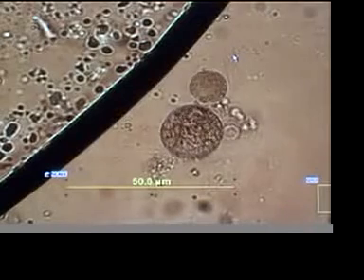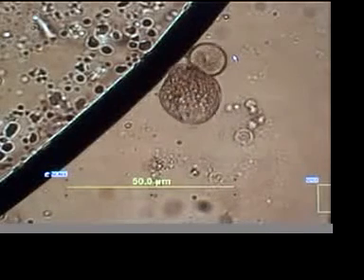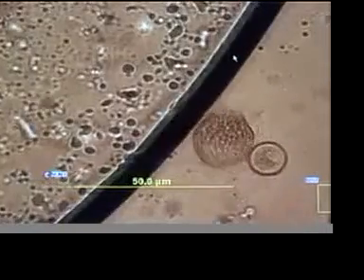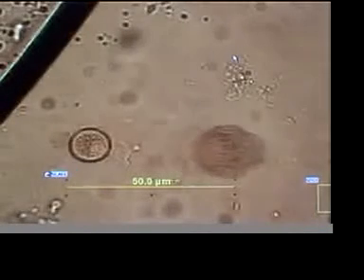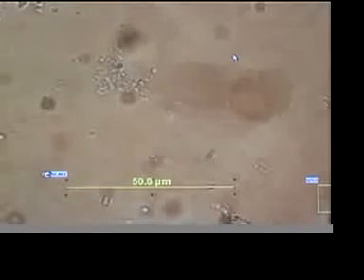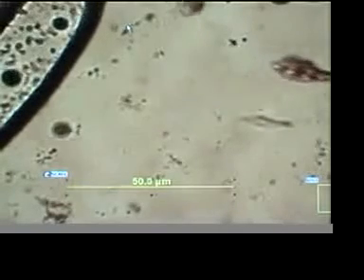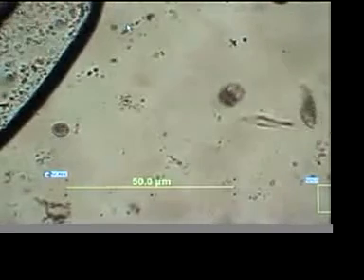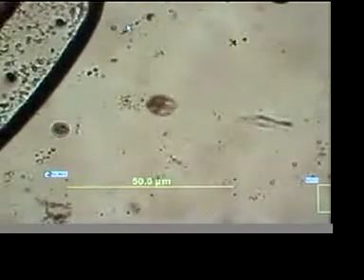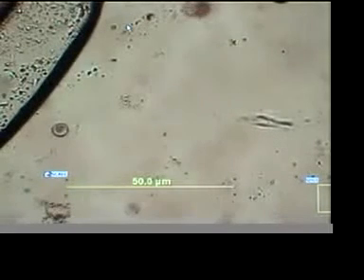He may undergo further changes. Let's watch for a moment. And oddly enough, something's moving. He's moving fast. Look at that. Little piece of him takes off. Like a, try to focus it. What's left of him is flying around the slide right there. Look at that. Incredible. There he is. It's too fast to photograph.